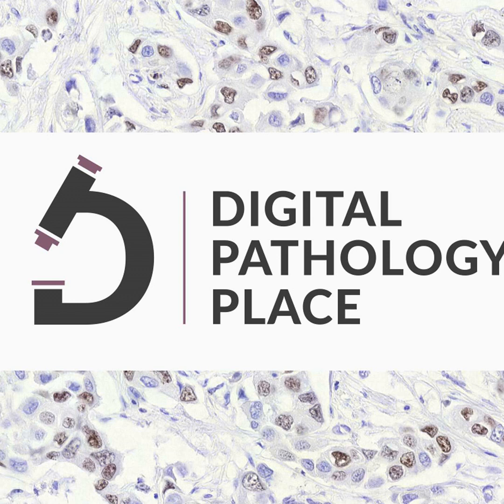And yeah, what I wanted to say before is that you need specialized data, specialized hardware for data storage, and then also for the computation. And there nowadays, you have 2 ways. I think the ideal way is to really go into the cloud and then use scalable data and computation solutions there. Or you are lucky and you're working in a company with a huge data center and can do that locally with a high performance compute cluster. But these are the 2 ways to approach really large data sets of MIF data. Doing that only locally on a computer is a little fun. Yeah. You're going to be spending a day working on one image, maybe.